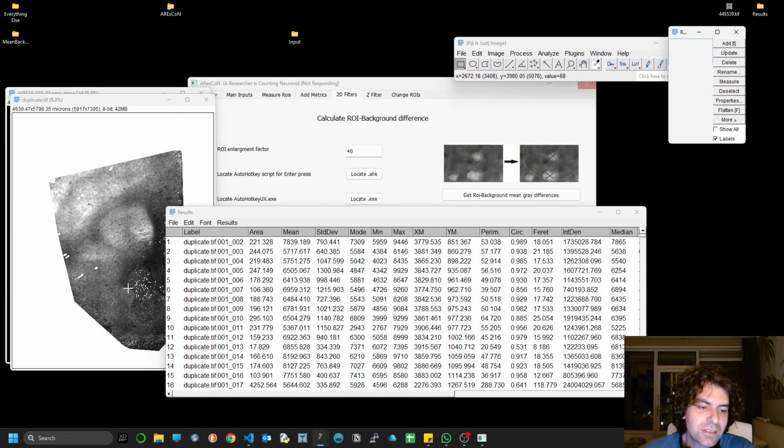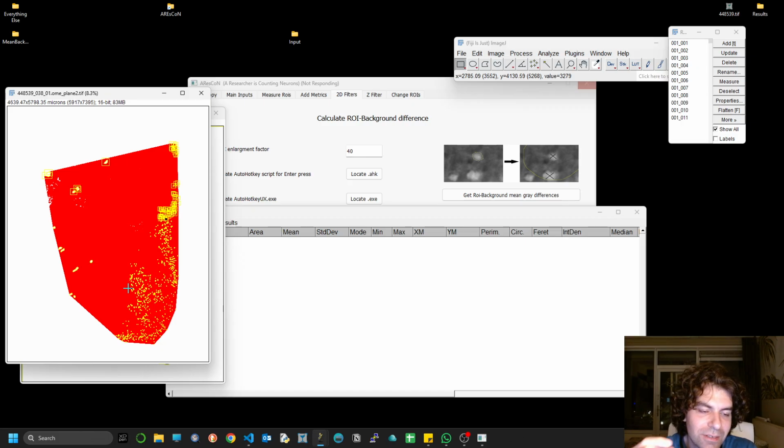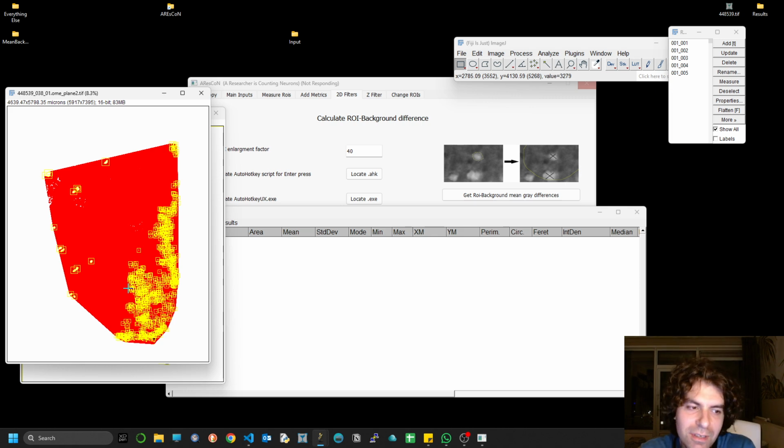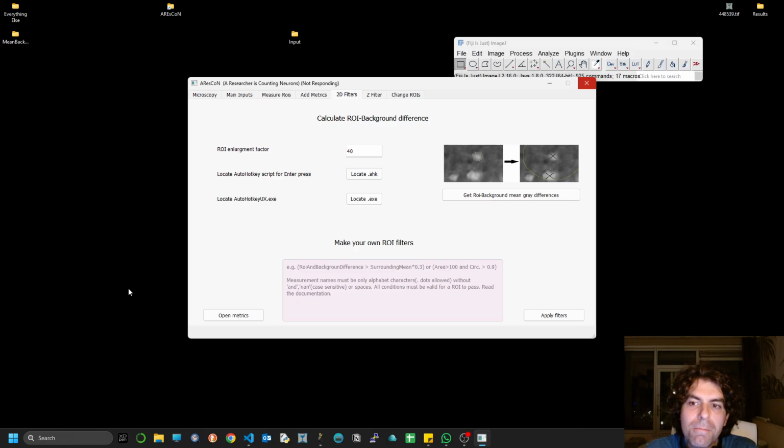and you can see that what's happening right now is that we're applying our ROIs, we're masking these regions out, and these rectangles that you see there, these squares, are actually the regions that are enlarged. And we're taking the mean background of these regions, but we're excluding every white part that you see there, as I described earlier. Everything that's whitened is a mask, so it's not included in the estimation of the relative background, and the rest of the information is there. We can see one more, and then I'm pausing the video and continuing after all the information is obtained.